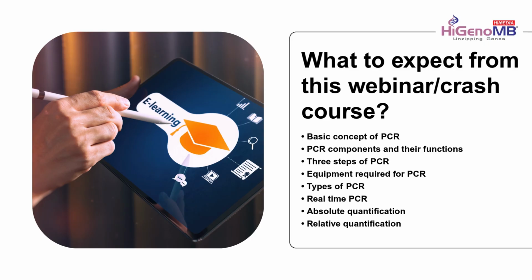Okay, so now as we established why we should know about PCR, what will this course cover? We will cover the basic concepts of PCR, what are the PCR components and their functions, what are the 3 basic steps of PCR, the equipment and the types of PCR, mainly real-time PCR and its uses.